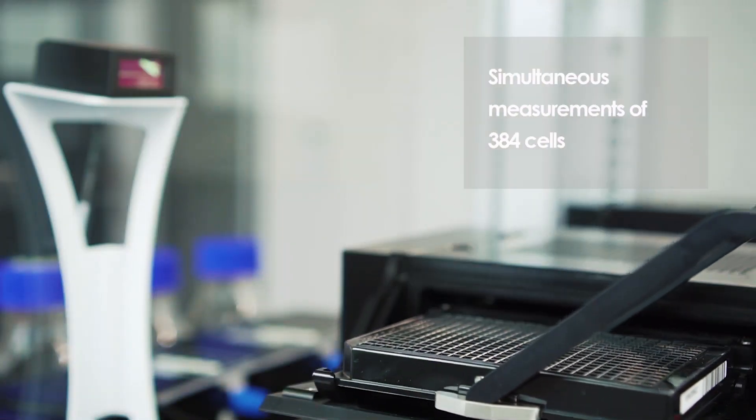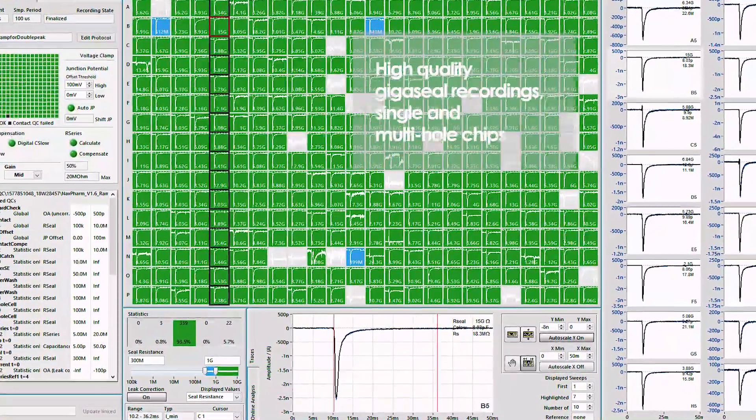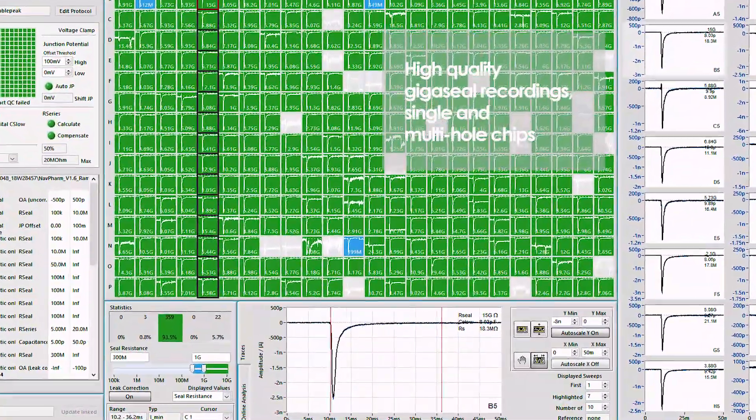Measure 384 cells simultaneously. Record high-quality data on single cells or using multi-hole chips.